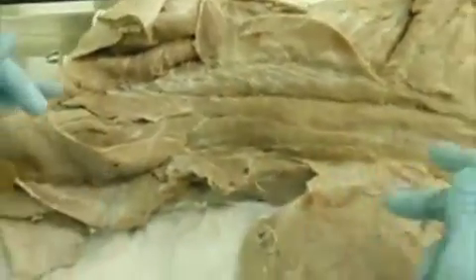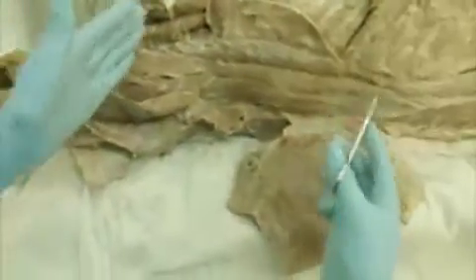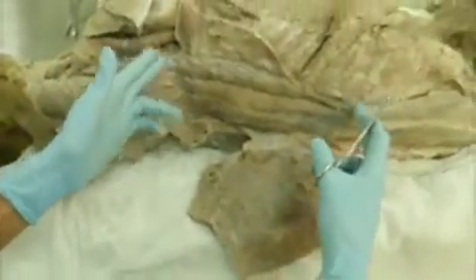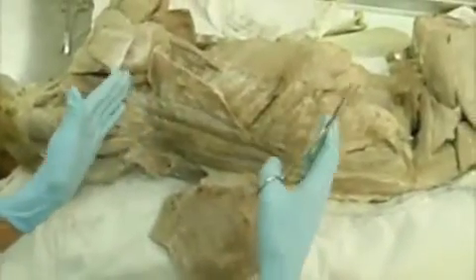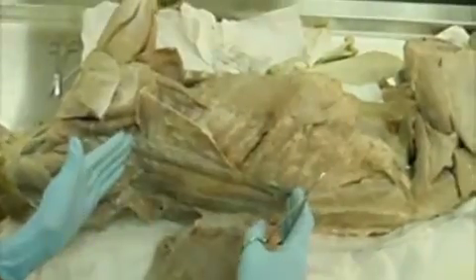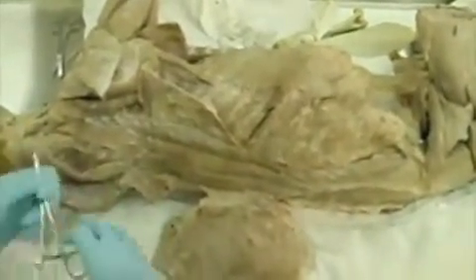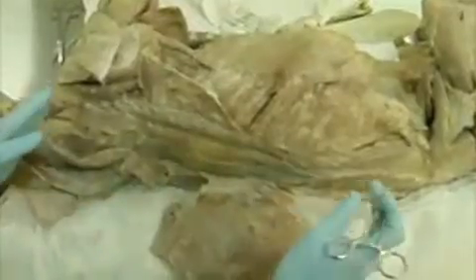Also remember, there's no specific demarcation where these muscles start and end. You just have to have an idea. Obviously, if it's thoracic, it's in the general thorax region, so where your thoracic cage is, and then your lumborum is in the lumbar region, so in your abdominal area here. All right, so that's for your iliocostalis lumborum.